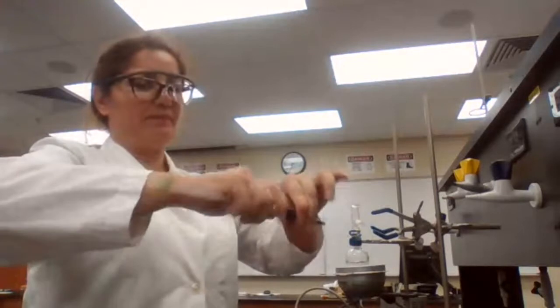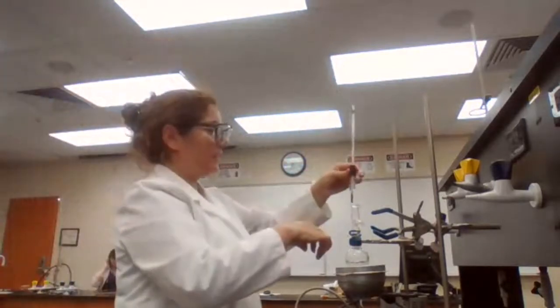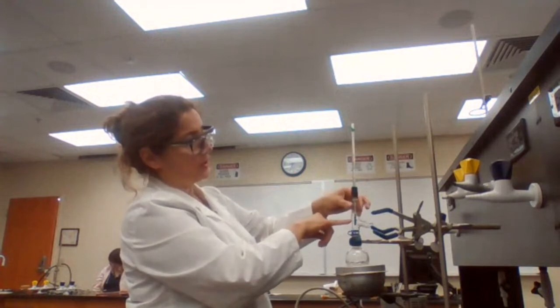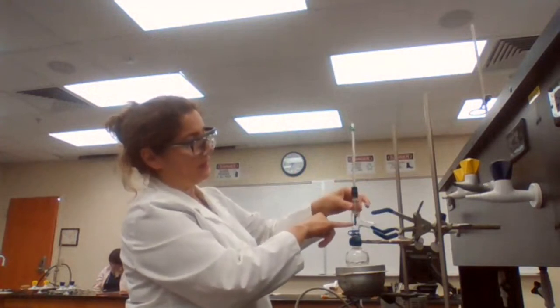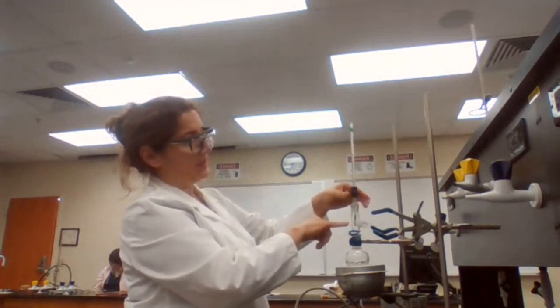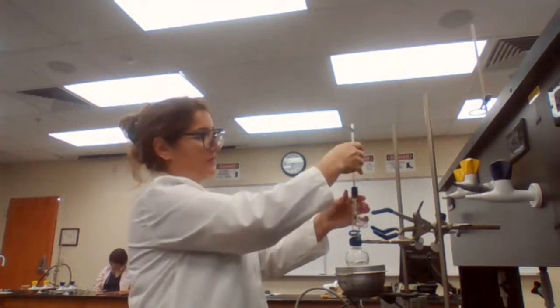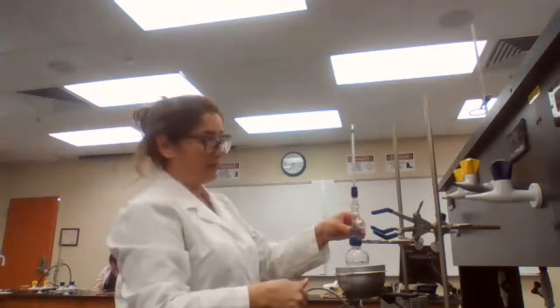And when you are holding, you have to hold it low, so it would minimize the lab breakage. The height of the thermometer bulb should be just below the neck of the distillation head. If it's too high, it's not going to record the temperature of the vapor. If it's too low, then it would record a higher temperature than the boiling point.